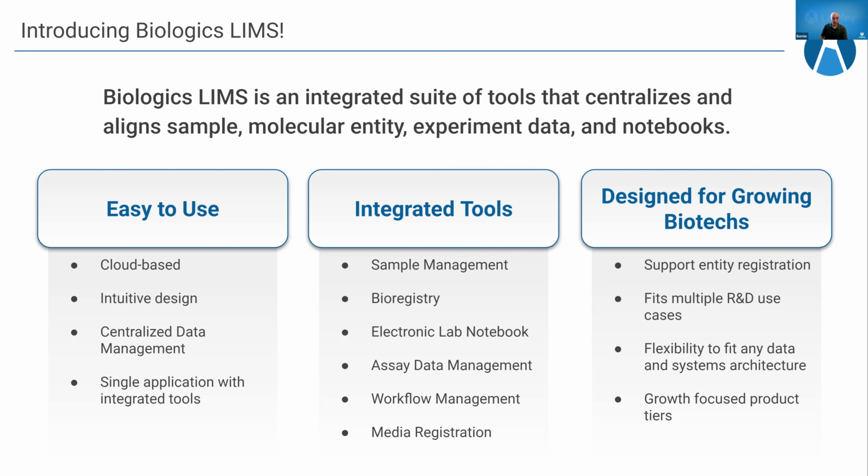It was designed with ease of use and adoption in mind. Those are some of the main themes that you heard our CEO talk about yesterday as being major product themes at LabKey. We know that organizations need solutions that can be deployed rapidly without undue barriers to usage.